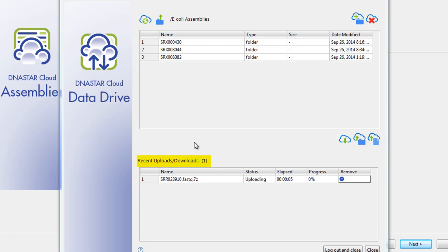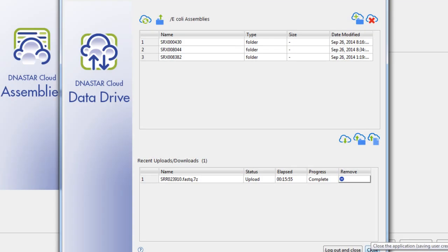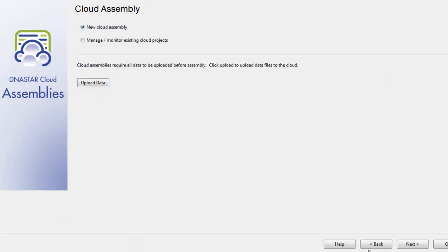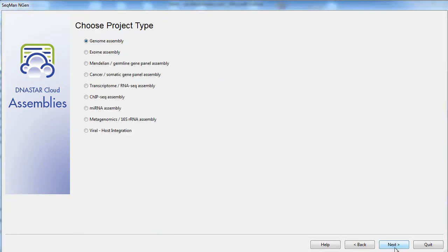We can see this appear in the Recent Uploads Downloads menu. After I'm finished uploading my files, I can choose to close the data drive. Now back at the cloud assembly screen, I'll choose to proceed with the new cloud assembly.